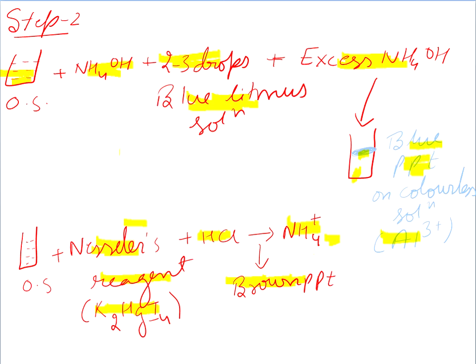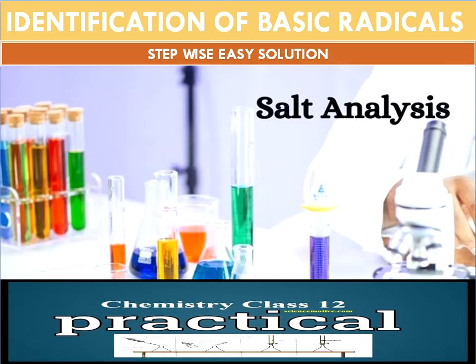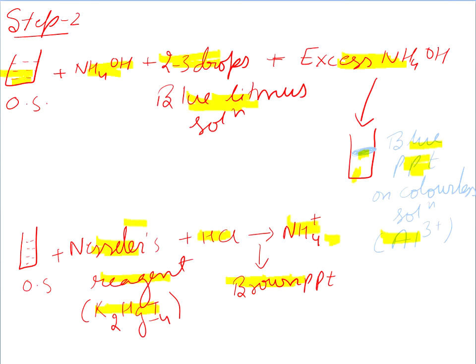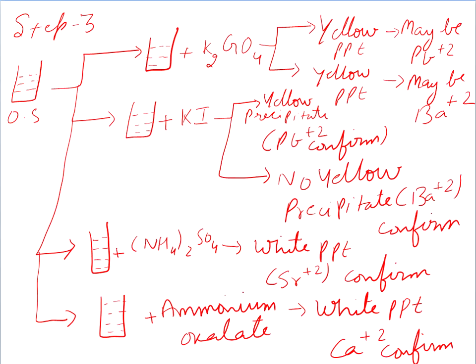If these steps are not happening, listen carefully, then you have to discard the solution, and again take the original solution, and then move to step number 2. Now moving towards step number 3, we have made the original solution already.